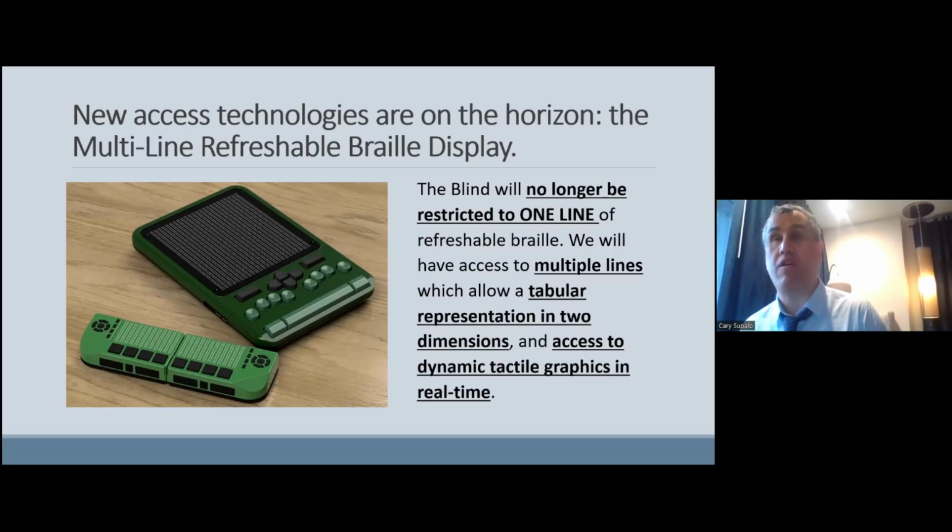This application here is using a prototype Android application to use a Vernier sensor, one of their GoDirect sensors, to collect data via Bluetooth with this device. And it shows tabular information, but also a graphical Cartesian graph in real time. So as your values are increasing, you can feel the graph increasing under your fingertips, or vice versa. If it's dropping, you can feel it.